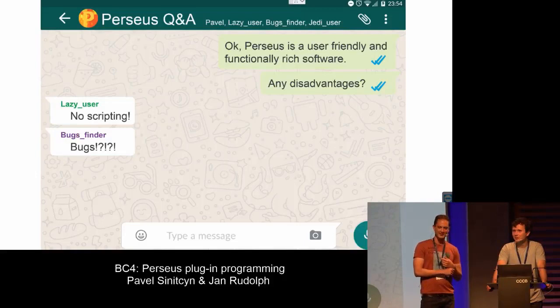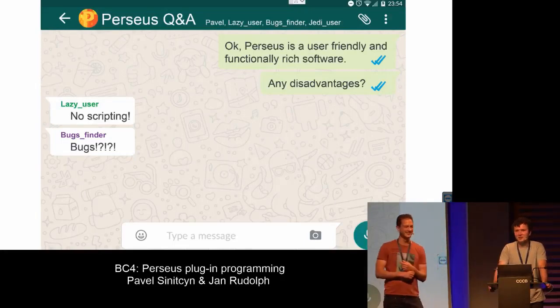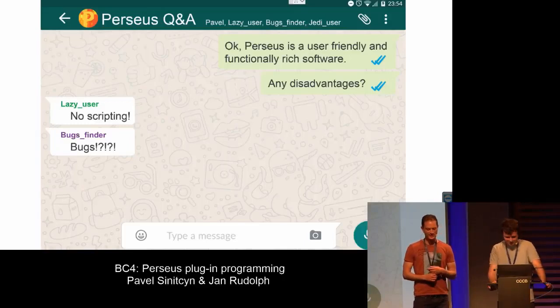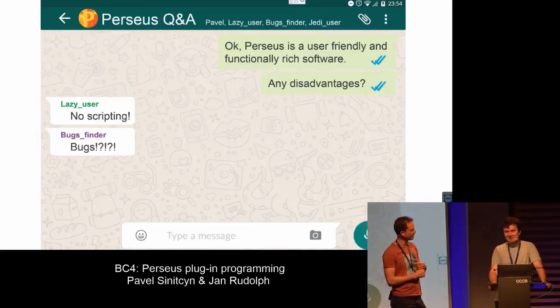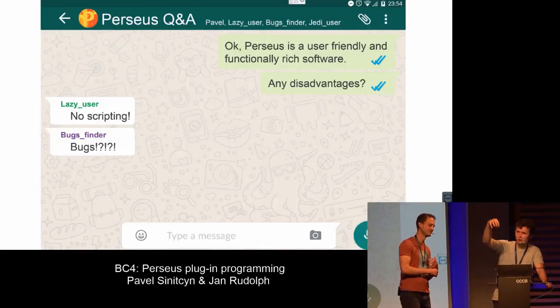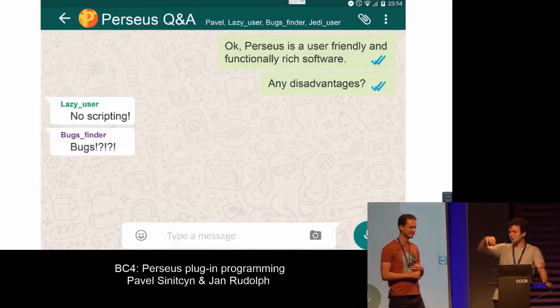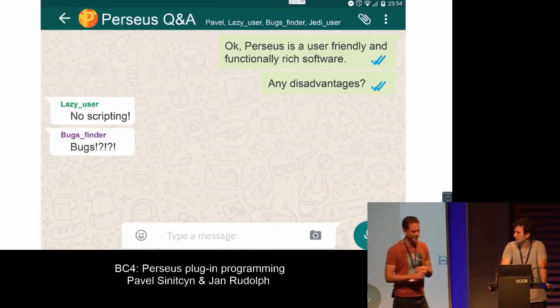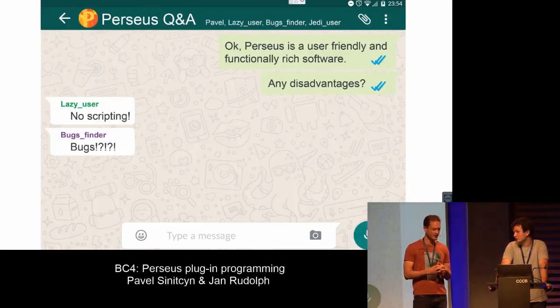But you understand what I mean. Imagine today you had one data set, you run it through by clicking, and next you run almost the same and save it. So you want to rerun the workflow? Yeah, I just want to run it the next day. Instead of clicking, I want to take my data, insert it into the top of this tree of activities, and at the end of the tree get results. It's a beautiful dream.